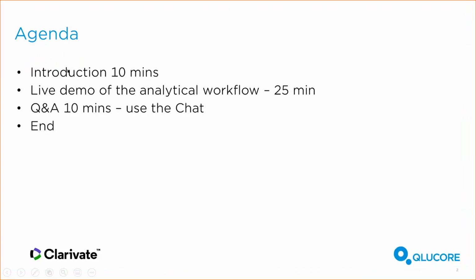The agenda for today is that we will start with an introduction, giving you a brief overview of the two softwares, and then an introduction to the biological background of today's topic. Then we will do a live demo of the analytical workflow using both our softwares, and we will end with a Q&A session. For that, please use the chat that you will find. So ask your questions in the chat. We will have a look at that at the end of this session.